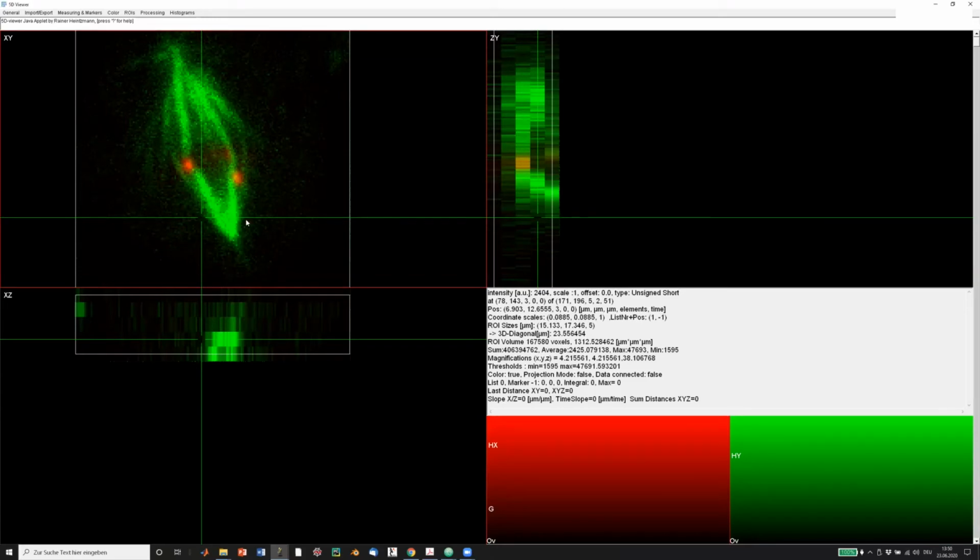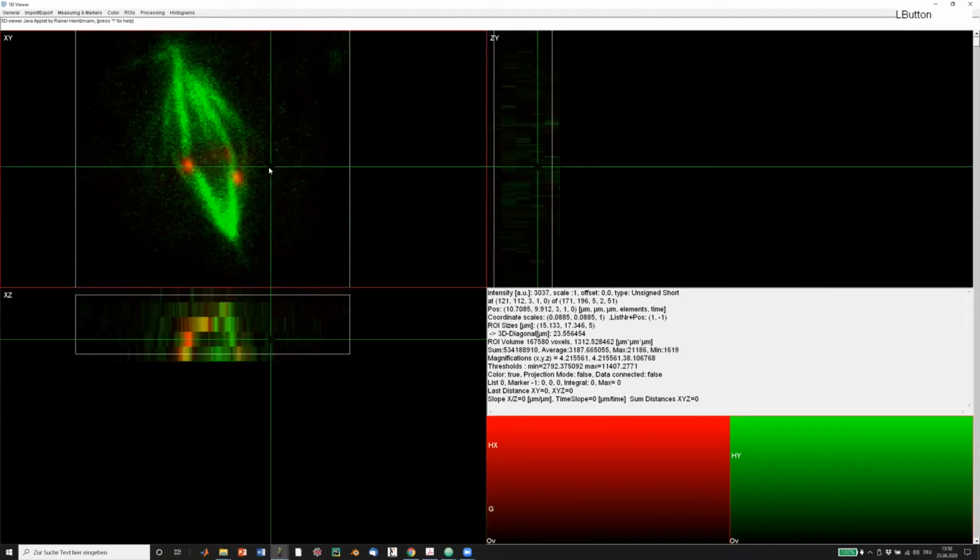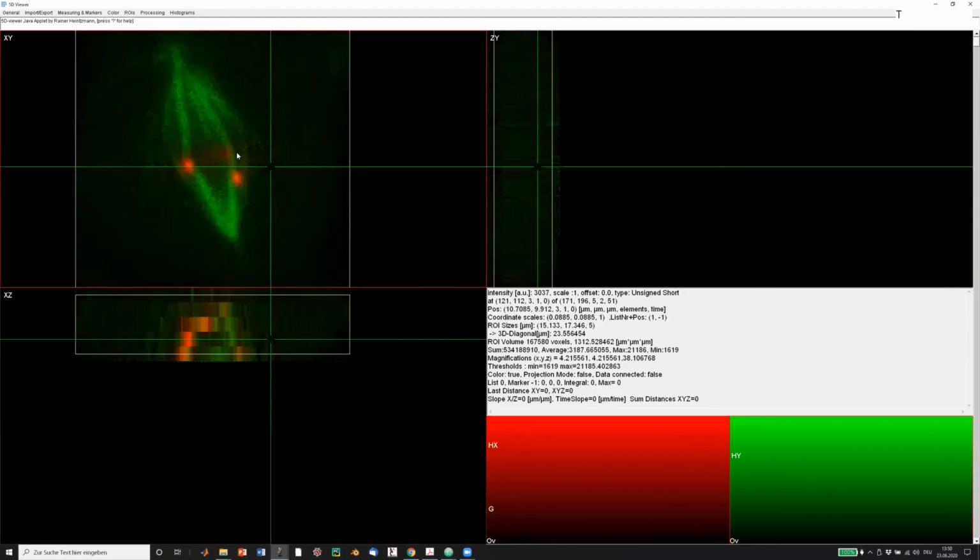And let's go to this color channel, and we could do the same, but sometimes you want to adjust your thresholds automatically. So one way of doing this, for example, I go back to the green color channel. If I press T, then it automatically adjusts thresholds to min, max in that current range that is displayed.